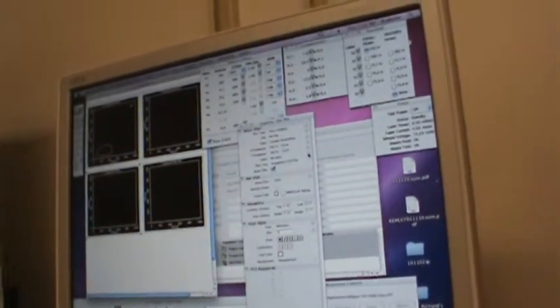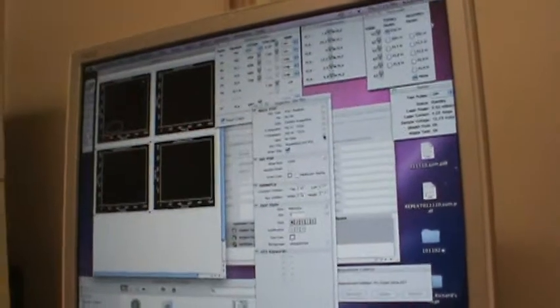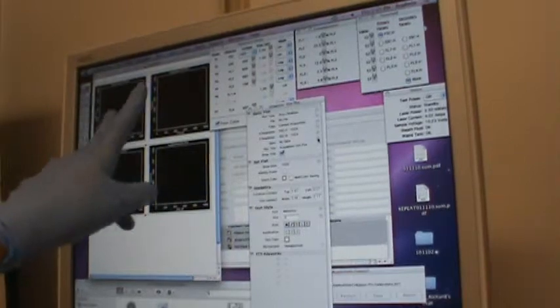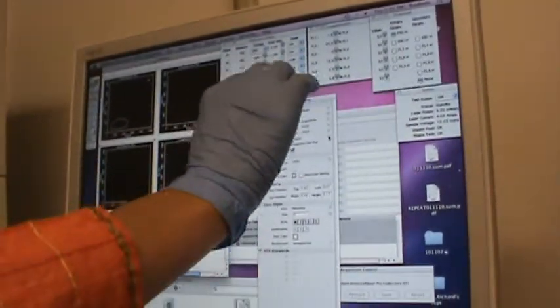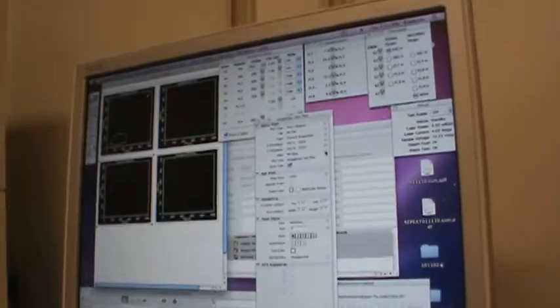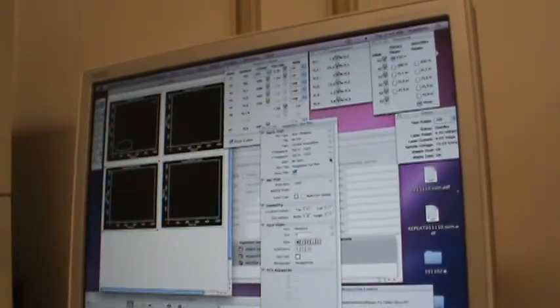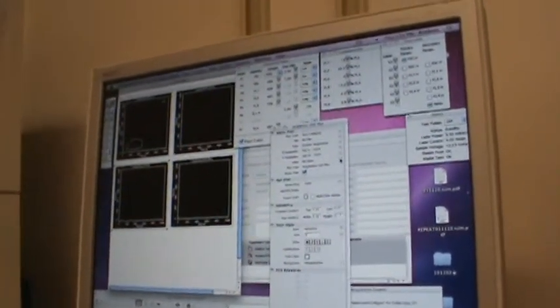That's what confused me. So each one is called a channel, and this one is called a gate. Yes, this is a channel because you're measuring the parameter, whether it is your PI, FITC, PerCP or APC. But this gate has nothing to do with that, because these are two totally different things. This is the voltage which helps you detect that signal. This gate is just to target the subpopulation you want to see.